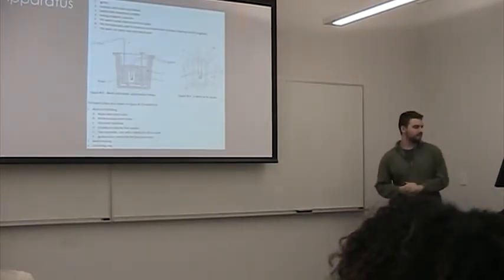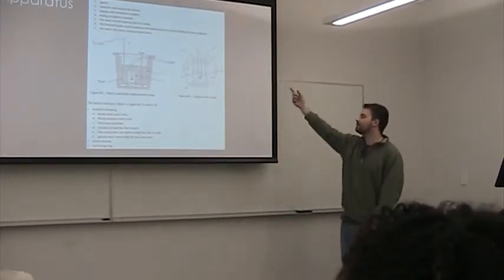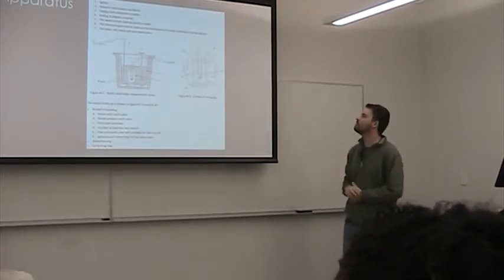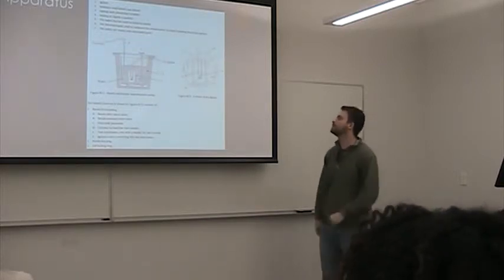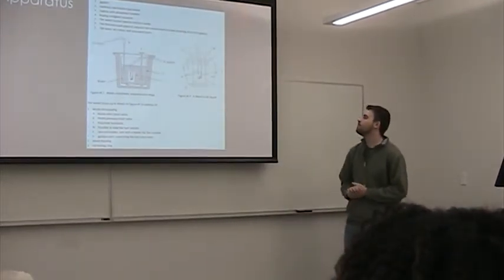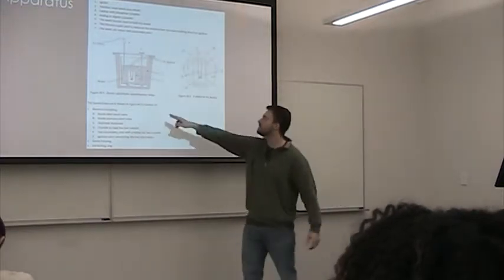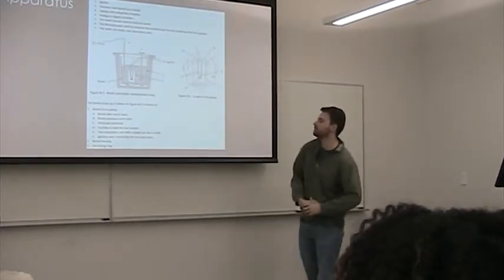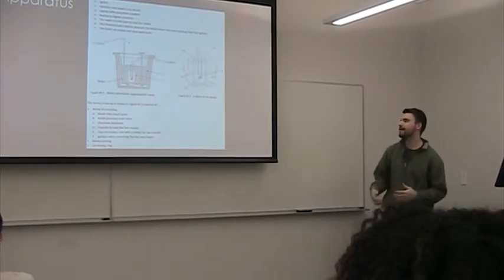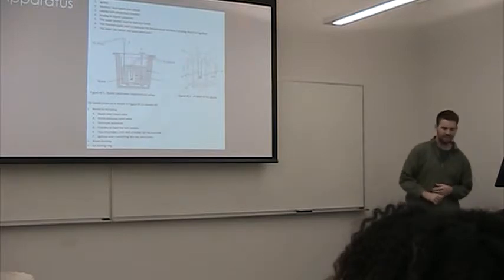This is the apparatus that we use. All the parts are labeled here. There's an igniter. Obviously, you want to blow it up. The main component is that stainless steel bomb there, and the water right here. Everything else is basically just data acquisition and setting the fuse up. It sits in this big jug. The stirrer helps distribute the heat a little bit better so that you get better results. It's a pretty straightforward system, although it's kind of finicky, actually.